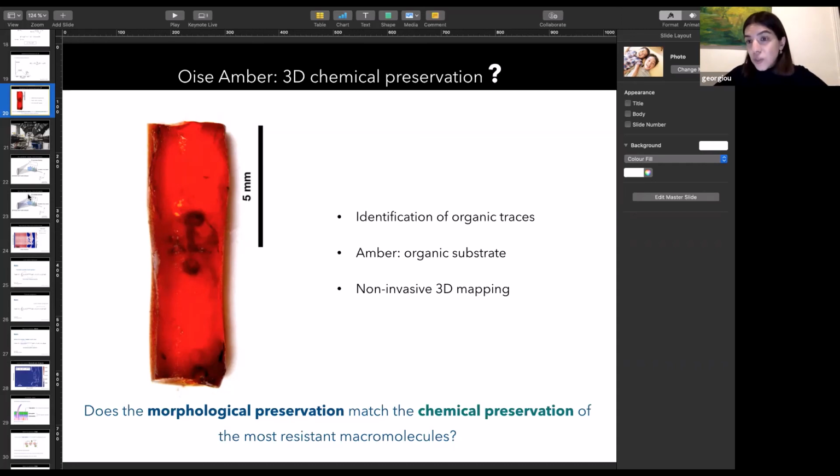This will reduce the flux going to the sample and also improve the energy resolution of our spectrum. So in this way, I think we would have less radiation damage.